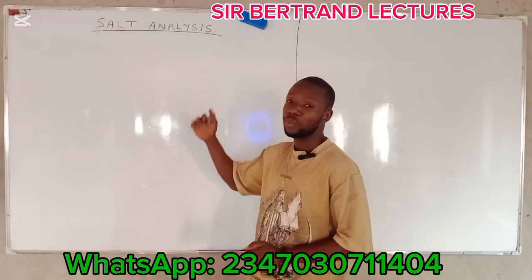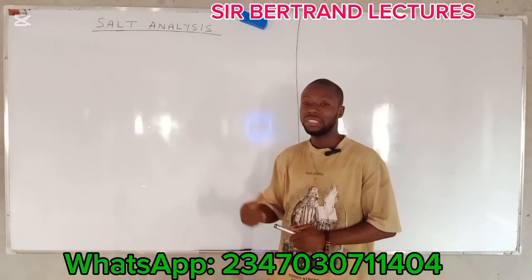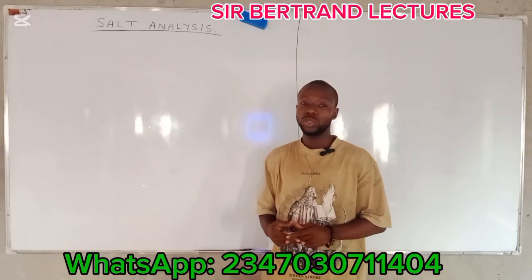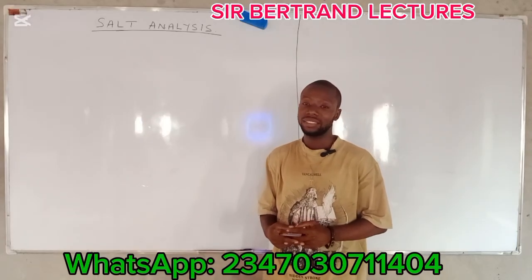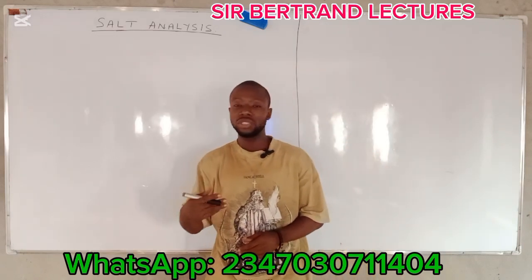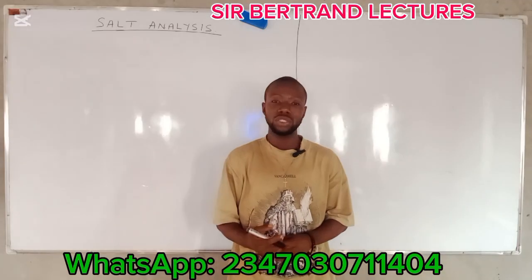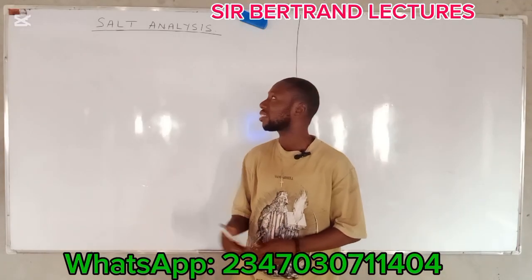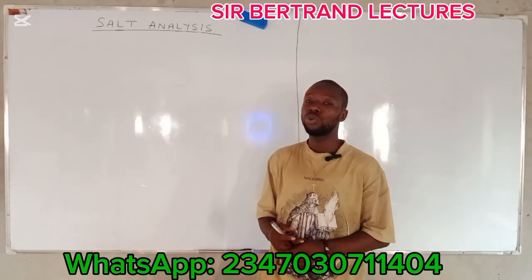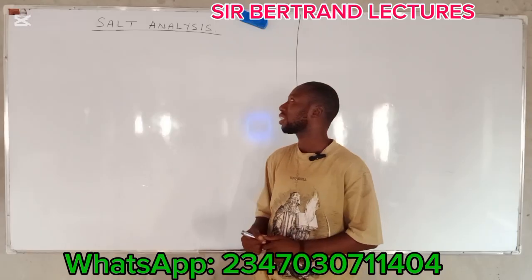Today, we are going to continue from where we stopped in the last class, the salt analysis. Last video, we discussed a series of experiments which we use to detect the anions that are present in an unknown given salt sample. All right? So today, just as I told you in the last class, we are going to look at the 8 key ways to know the cations that are present in an unknown salt sample.